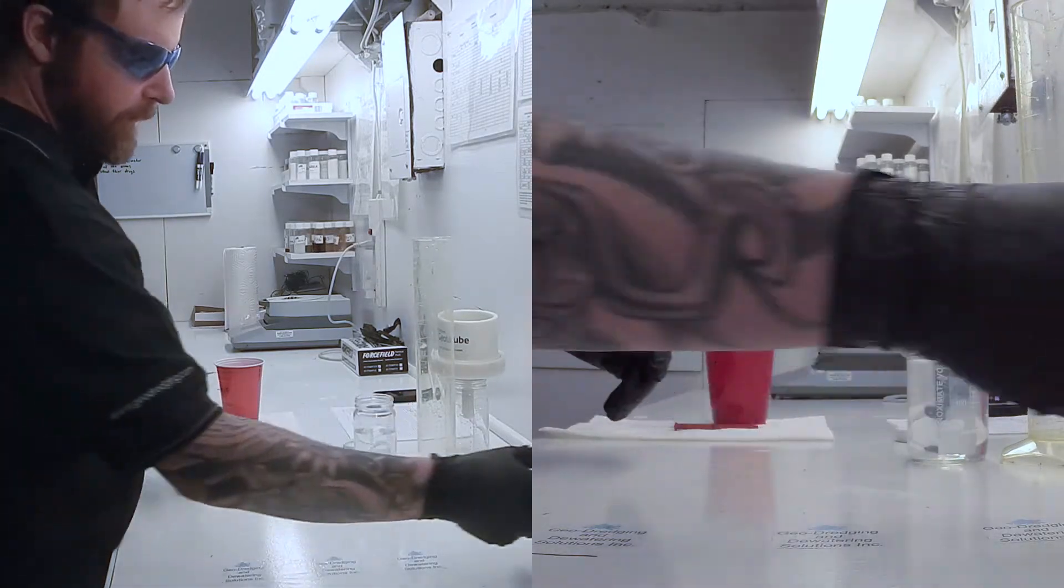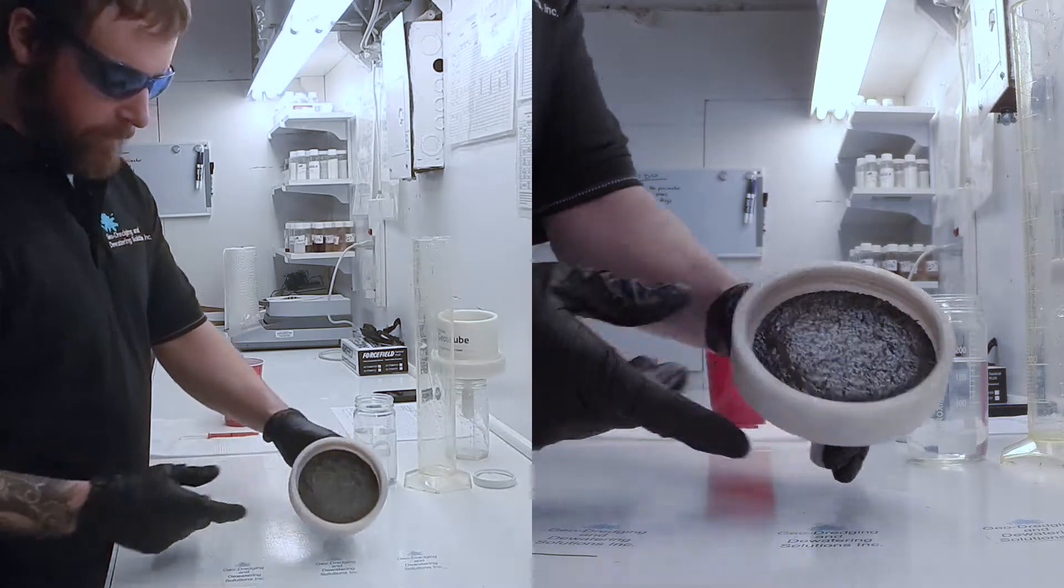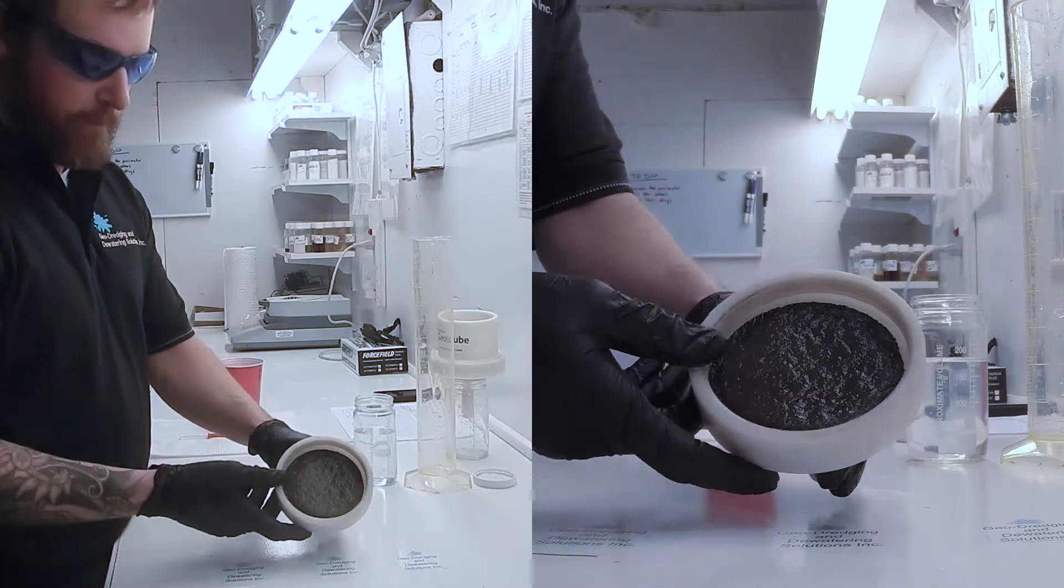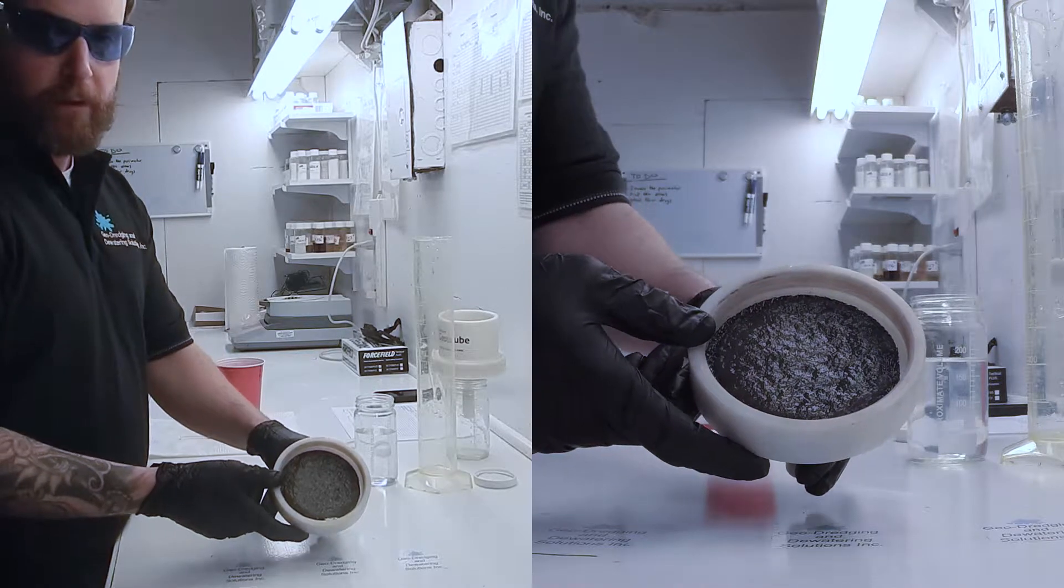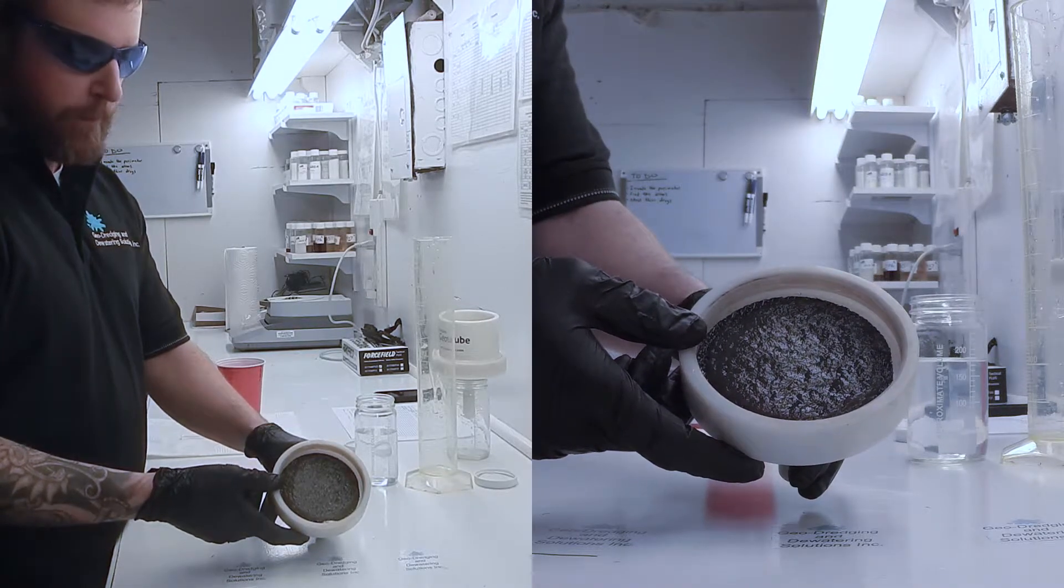What we're also left with in our RDT is a cake. It gives us a good idea of what the material will look like once it's dewatered. We can then also measure the moisture content of our dewatered material.